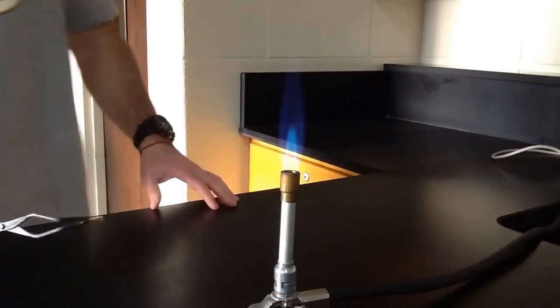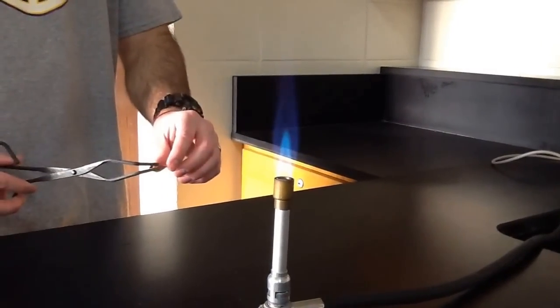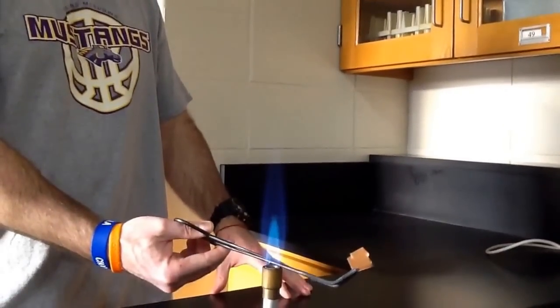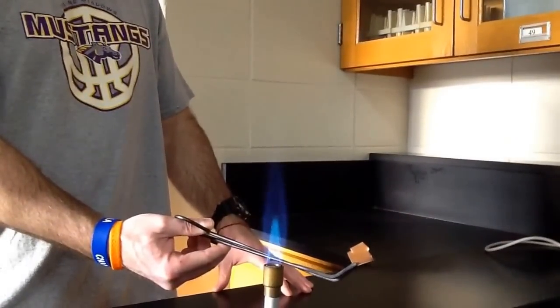And we're going to start out with the reaction of some copper metal. So here we got some copper metal. Okay, so you see it's kind of a brownish.